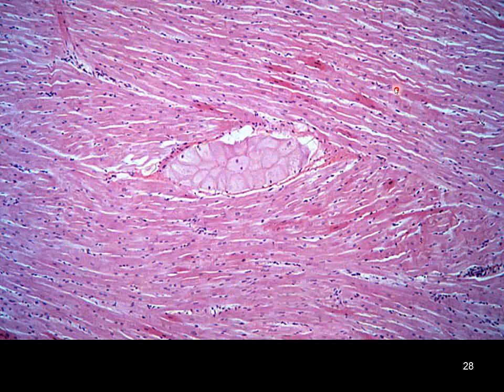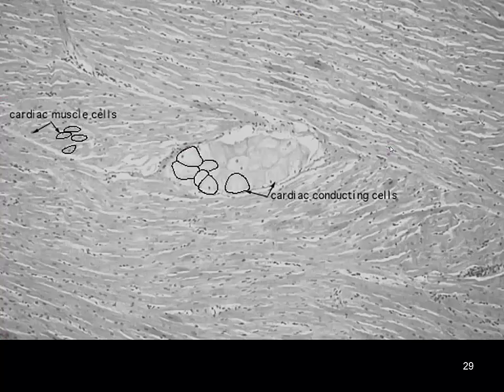So what we're doing now is we are transitioning out of skeletal muscle, and what we're looking at is cardiac muscle. And in fact, this particular bundle of cells here, these are going to be our Purkinje fibers, our conductive cells within cardiac muscle. So when you see something like that, very nervous system tissue looking, I know we haven't got to the nervous system yet, but it's going to be rather light, pale staining tissue surrounded by all of these nuclei, flowing cells arranged into sheets. You're pretty much going to be thinking either smooth muscle or cardiac, and in this case, cardiac muscle would be the tissue.